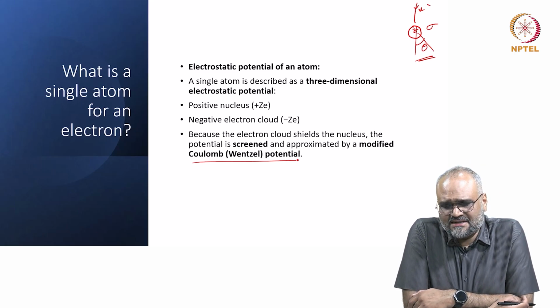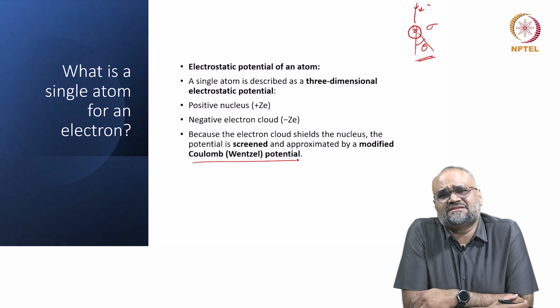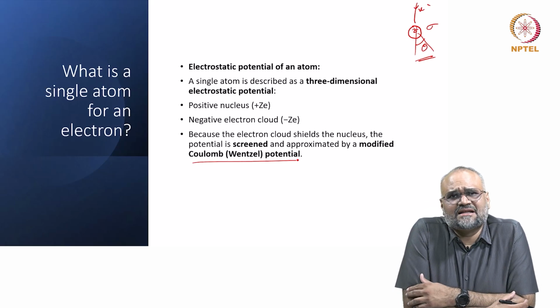When light propagates through a medium, there is a change in the refractive index which can cause a deviation in the path of propagating light. Likewise, when a charged particle or an electron encounters an isolated charged atom or a column of atoms, the Coulombic potential of these atoms together can modify the path of the electron beam. That is what we established from the scattering expression.